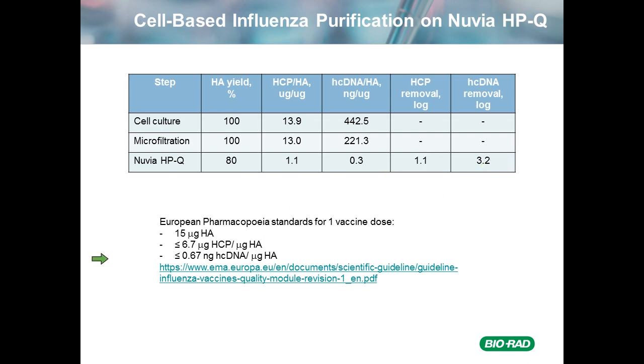Below, for your information, I put the EP standards for a vaccine dose. And I've given the reference. You can look this up at your leisure if you want to. But you see that both of the quality outputs were well below what's required by the EP for a standard vaccine dose. So this was a very encouraging response. And again, this is now going into clinical trials.